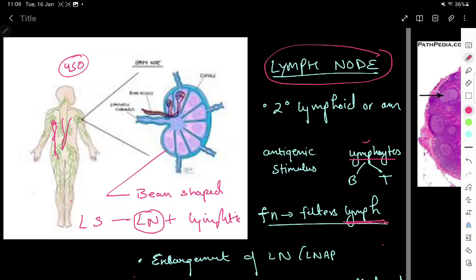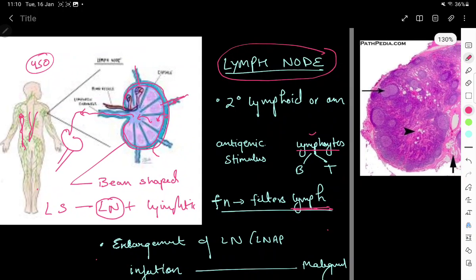The lymphatic system is very important for immune system functioning. Lymph nodes are tiny organs present throughout our body, and these have multiple afferent channels. The lymph node is surrounded by a capsule, beneath which we have a sinus. All of the afferents bring lymph, which drains into the sinus. Via the sinus it goes into the cortex, beneath which we have the medulla, after which it goes into the efferent channel, which can go to the next lymph node or to the lymphatic channel itself.